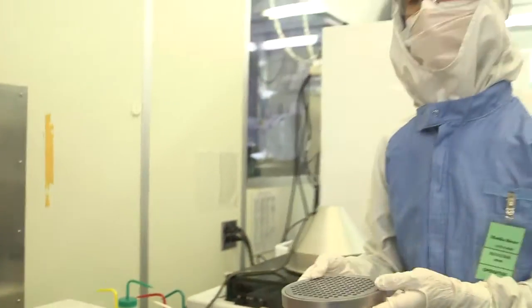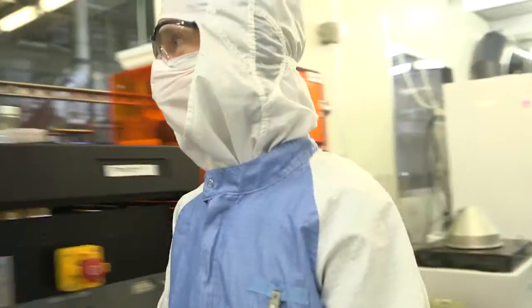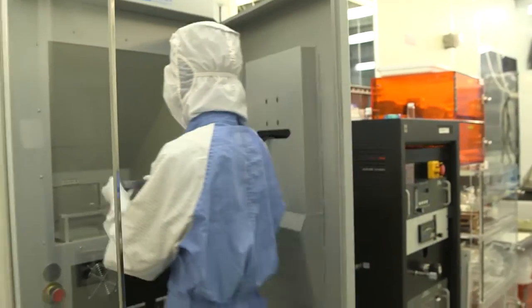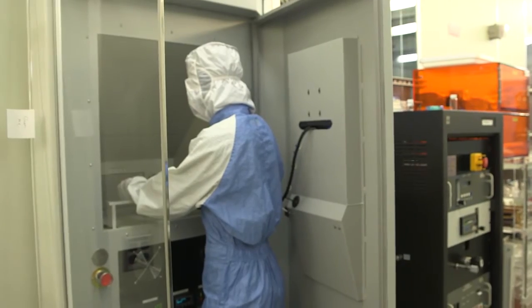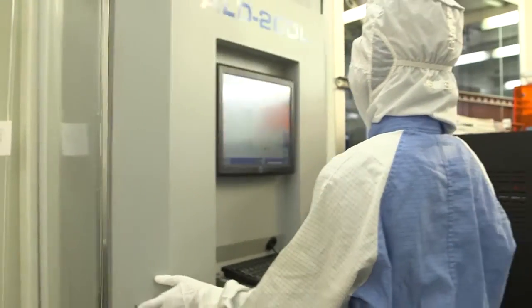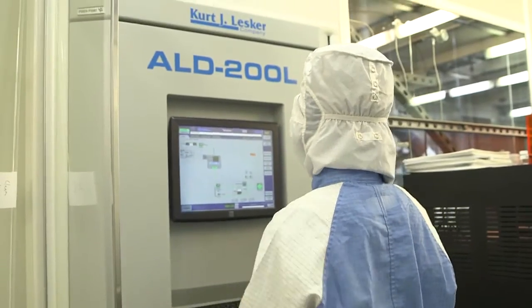This morphology of a material is very unique in a way that we can actually control the feature size and also the density, and we can easily exchange the composition by using a different ALD process. The materials we develop usually support the technological and scientific mission of the lab.